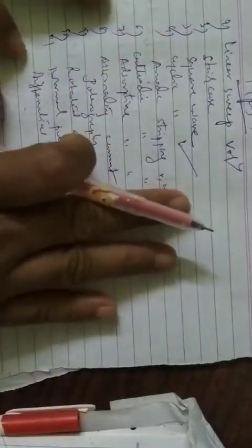So these are the different types of voltammetry, among which for your syllabus they have taken cyclic voltammetry, which you are going to learn, and stripping voltammetry, which you are going to learn. But you should know the different types of voltammetry.